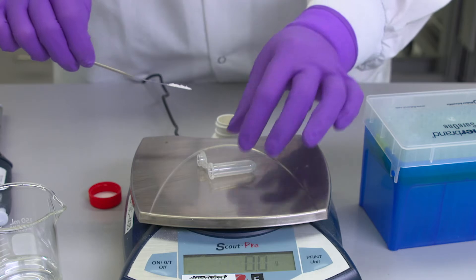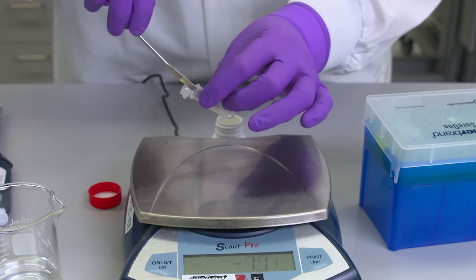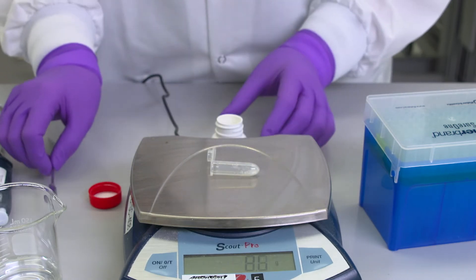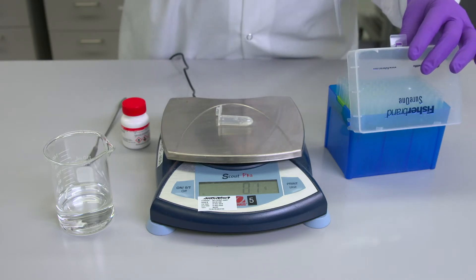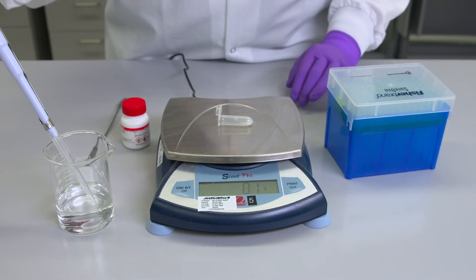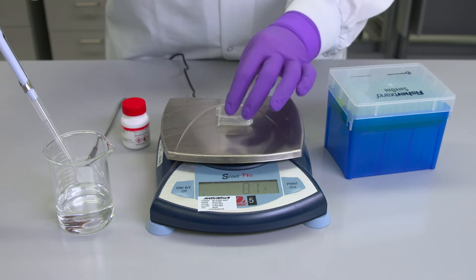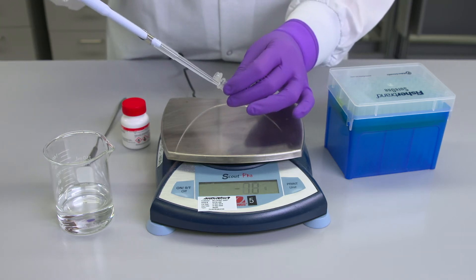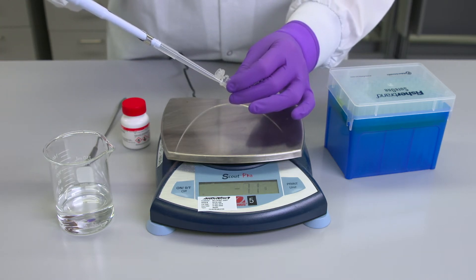Next I'll prepare a fresh 10% APS solution. APS in combination with TEMED initiates and accelerates acrylamide polymerization. The 10% APS can be made fresh before each use or can be aliquoted and stored at minus 20 Celsius.